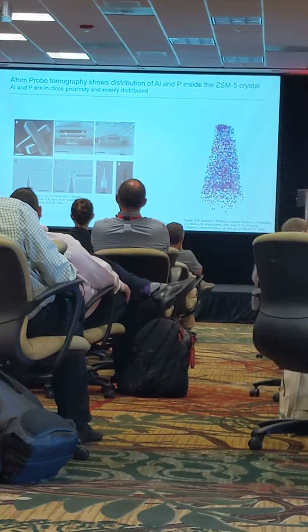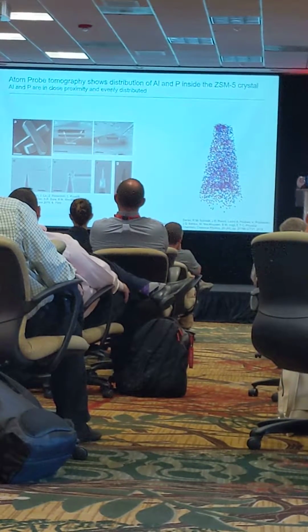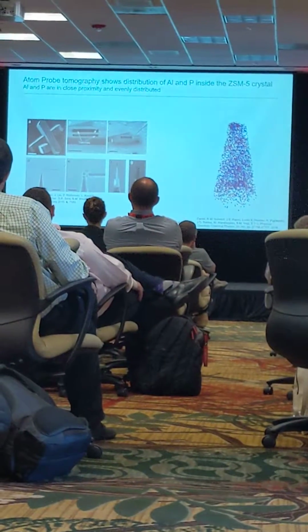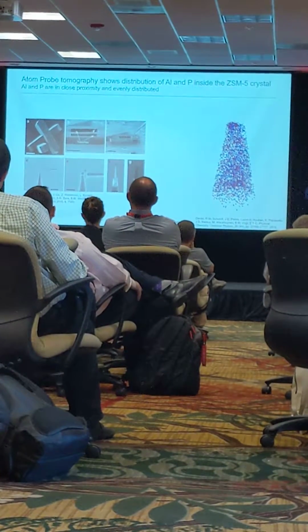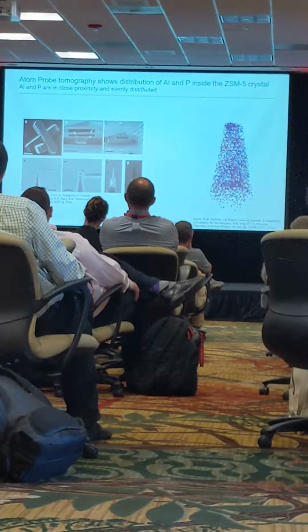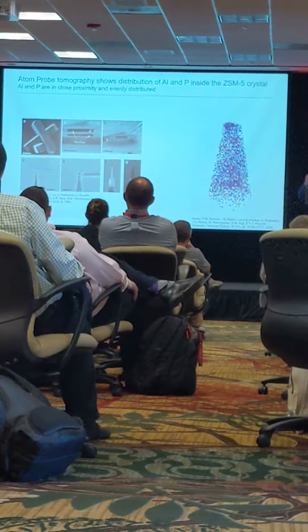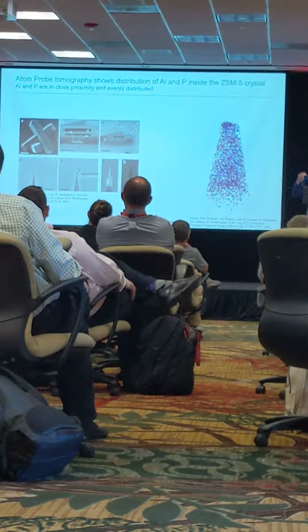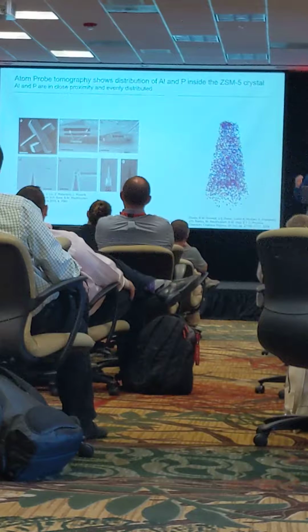Before we carve it out, we put a platinum and carbon cap on it that basically protects it. In picture C, you see the scientist using something called an omniprobe to lift out that lamella of the crystal. And then in picture D, they're inserting it and setting it on top of a silicon micropost. So the setup is done by picture E.